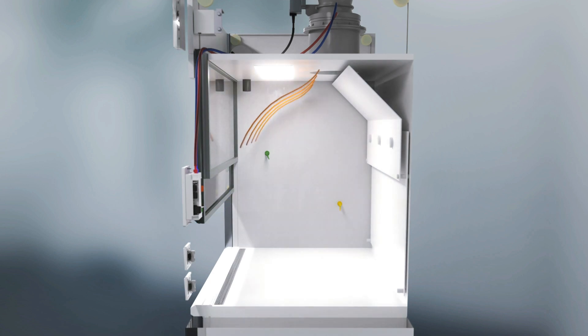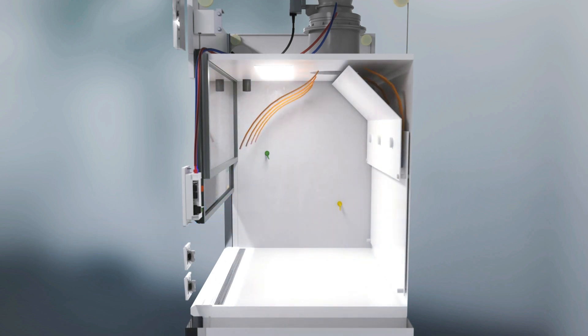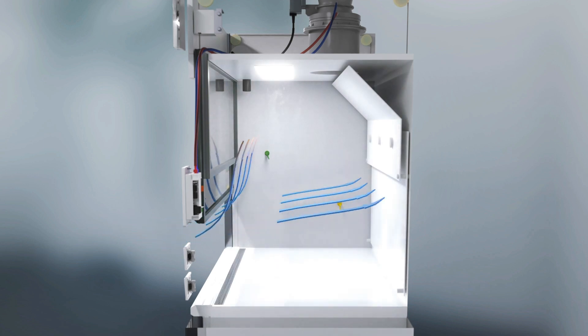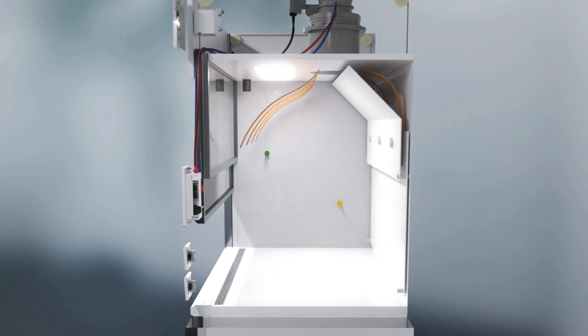The fume hood is provided with ideal design baffles to guarantee an optimal and consistent airflow to exhaust hazardous fumes.